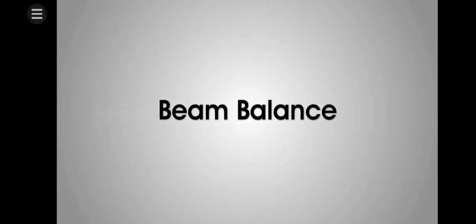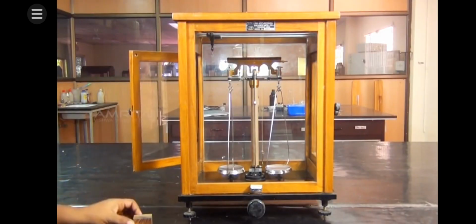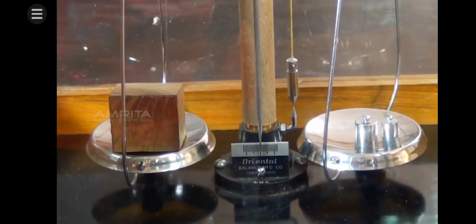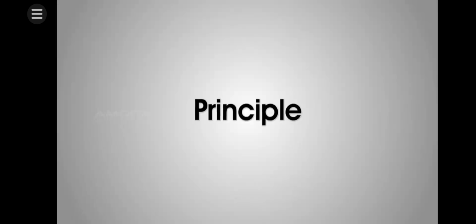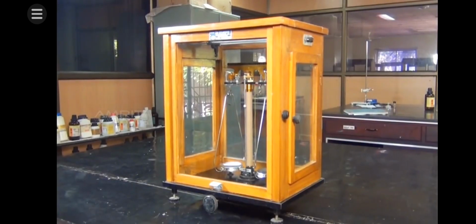Beam balance. A beam balance is a weighing instrument which helps in measuring the gravitational mass of an object that makes use of the principle of moments. Principle. Correct mass of the body using the beam balance.